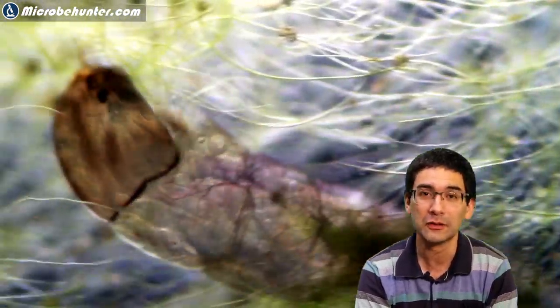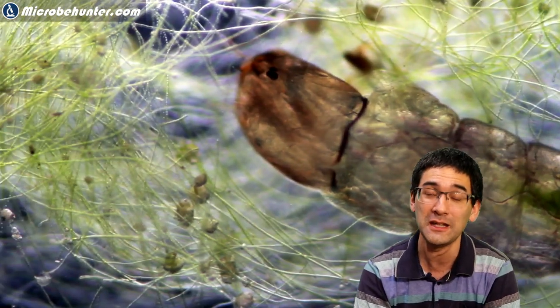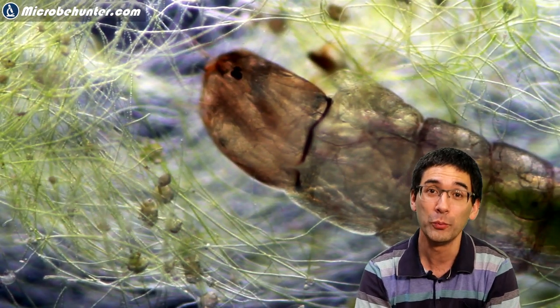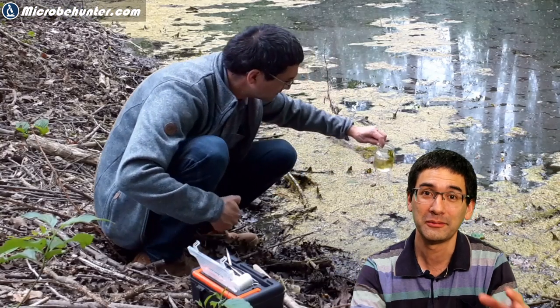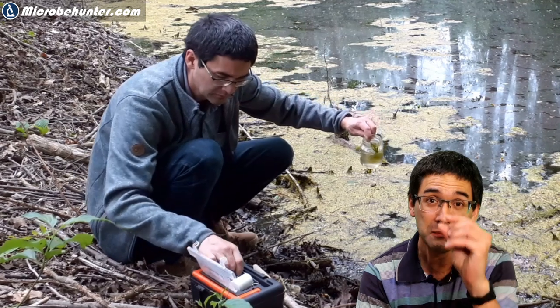I kept filming this little critter. I found out it's way too big even for the low power objective—I couldn't even fit it on properly. I think it was over a centimeter long.